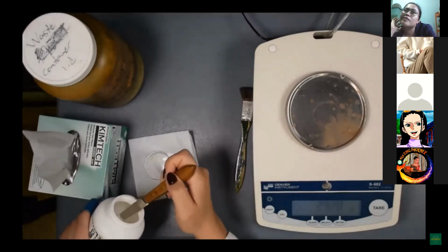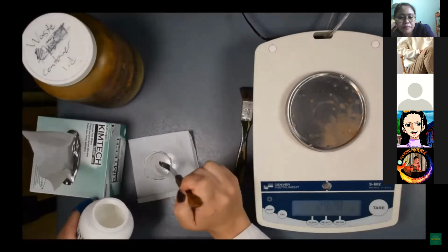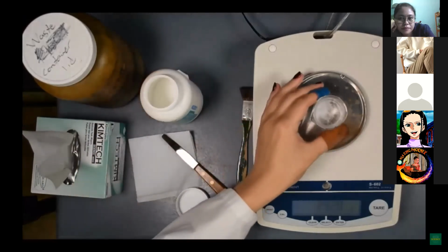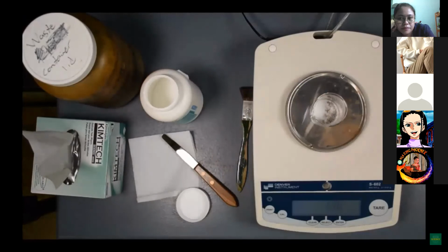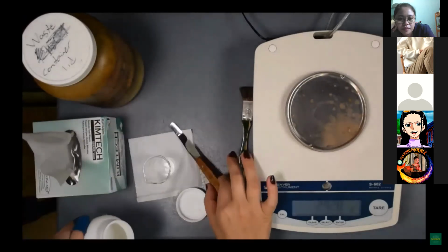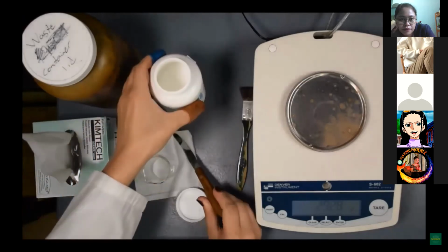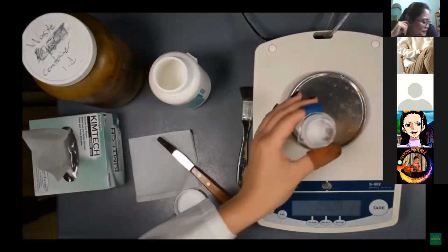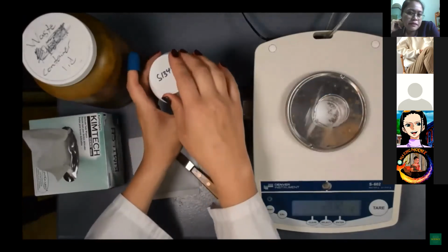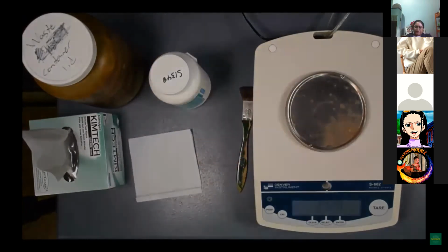Measure out the desired amount of compound to within 10%. To check the mass of compound added, return the beaker to the balance. Add or remove some of the compound as required. Be sure that any excess compound removed is discarded into the solid waste container and not returned to the stock bottle. Once the desired amount is added to the beaker, return to the same analytical balance that was used to weigh the empty beaker.